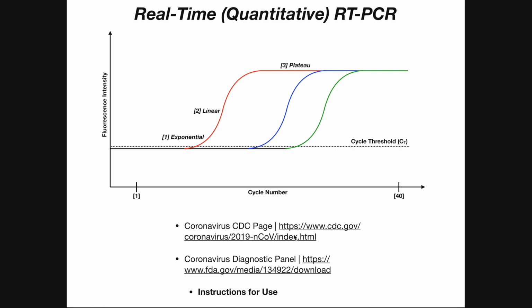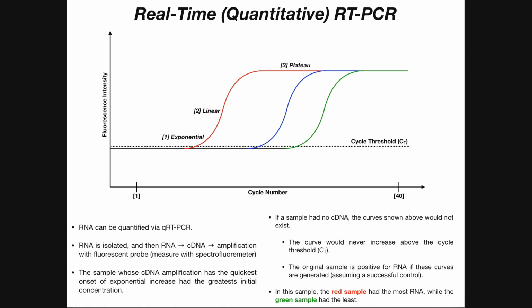And you can read more about this on the CDC page for the coronavirus. So hopefully you learned a little bit of something about quantitative real-time PCR and actually how they test for it. This is a simplification of it, and it's a little more complicated. They do it in an assay format in wells, but the idea is the same.